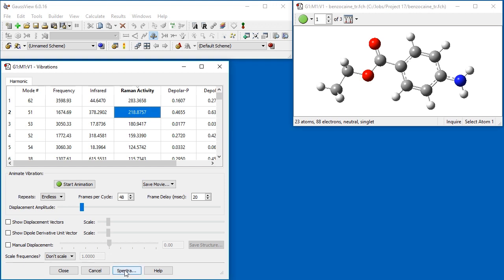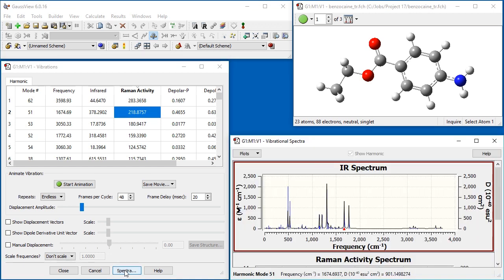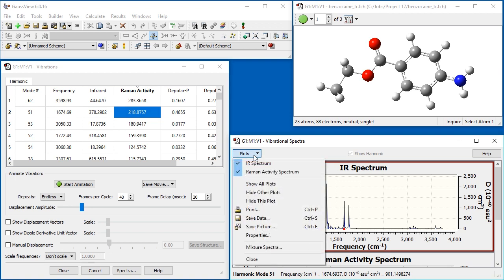We now open the Spectra window. The window contains plots of all available spectra for this result set. In this case, both the IR and Raman spectra are present. The current spectrum is indicated by a red border. You can control which ones are visible in the window using various items on the Plots menu.